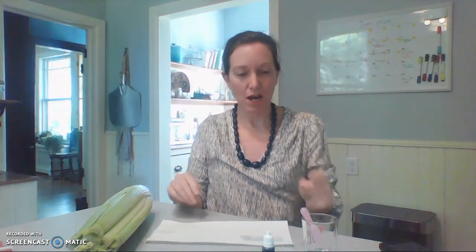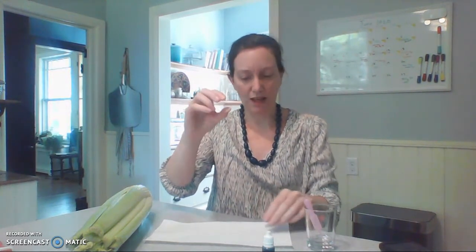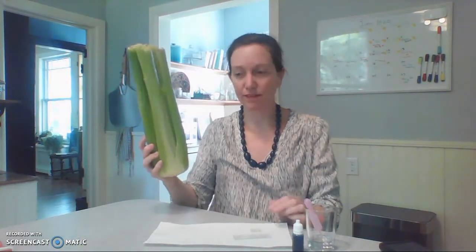Hi Bio 107 students, today I'm going to show you how to make a wet mount of celery. I have my supplies laid out: a cup of water with a pipette, a microscope slide, a cover slip, and stain — I'm using the blue stain today, which works best with celery. And I have my celery.